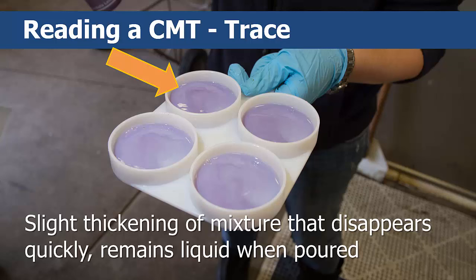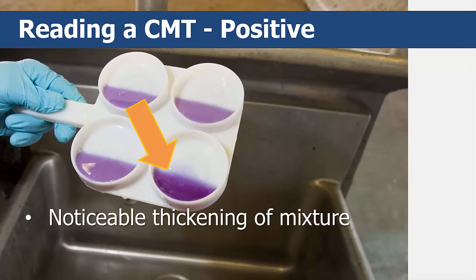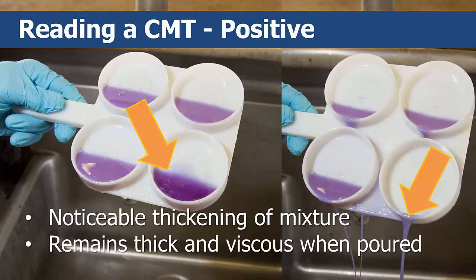However, if all four quarters read trace, then the cow is considered to be infected. And finally, if a gel forms and the surface of the mixture becomes elevated like a fried egg, and the central peak remains raised even after you stop rotating the CMT paddle, your cow is infected and her score is a strong positive.